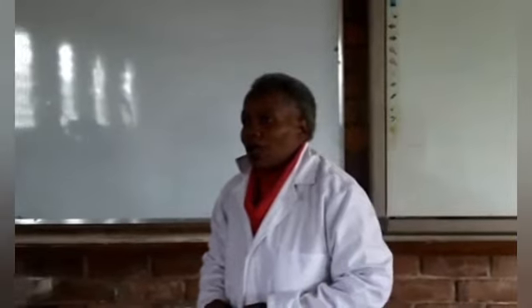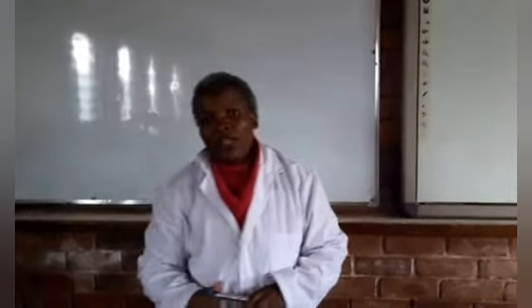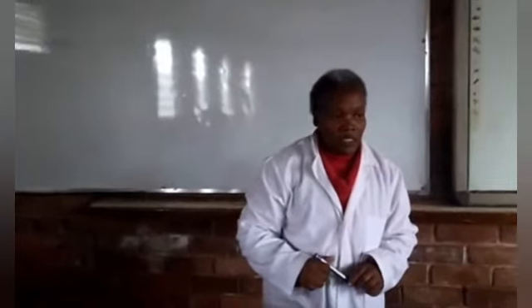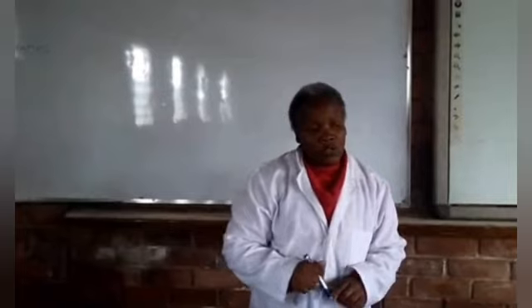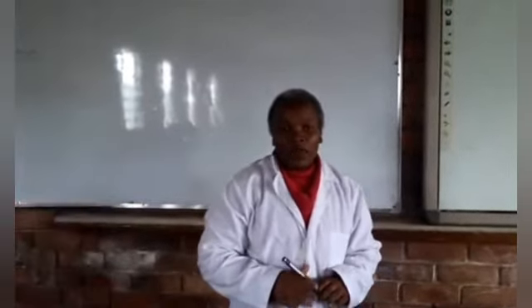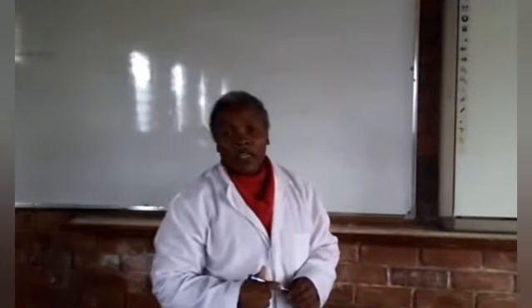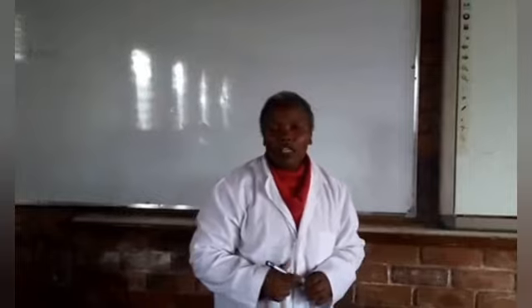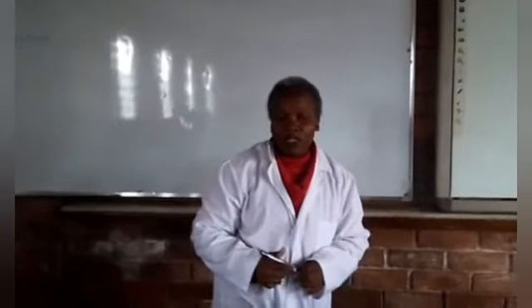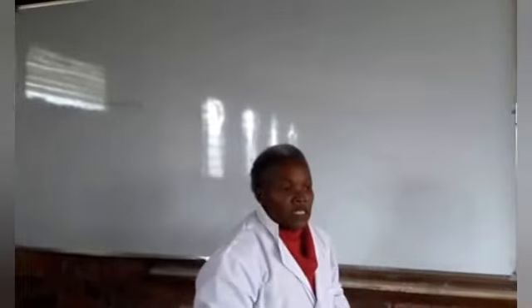So when you're experimenting, remember we said you are carrying out an investigation in order to gain evidence for ideas. Today we want to look at the reactivity of different elements, the elements which are on your periodic table. I have a few here, and we want to compare their reactivity, so that at the end of the day, we can have our reactivity series.